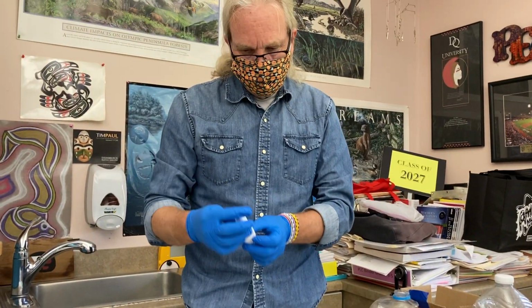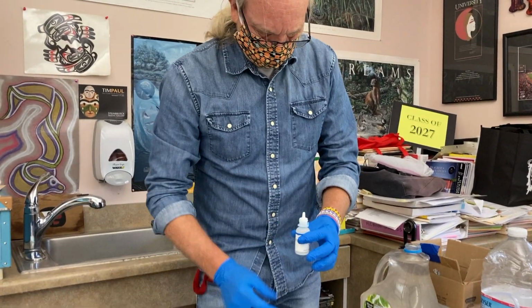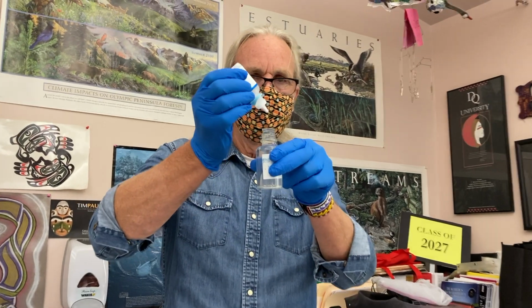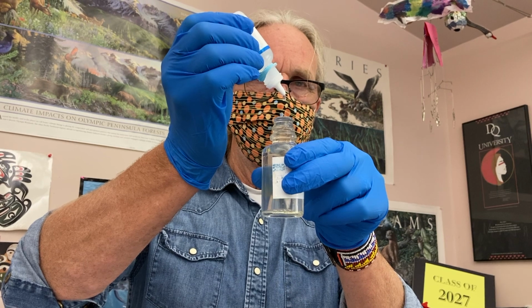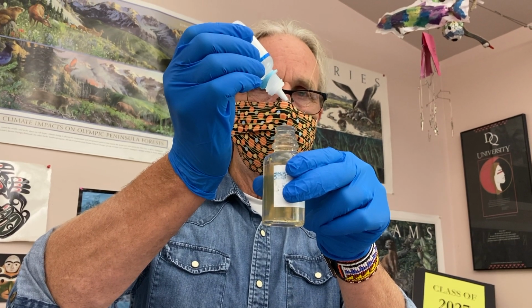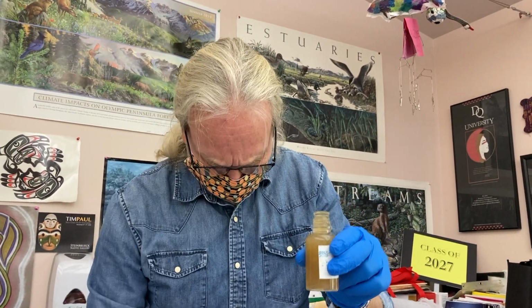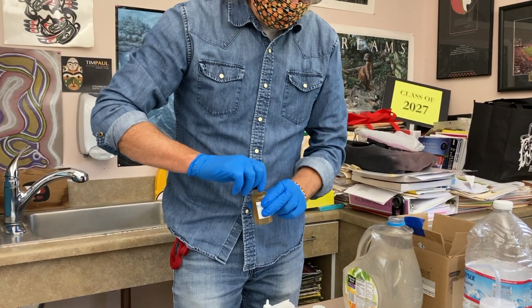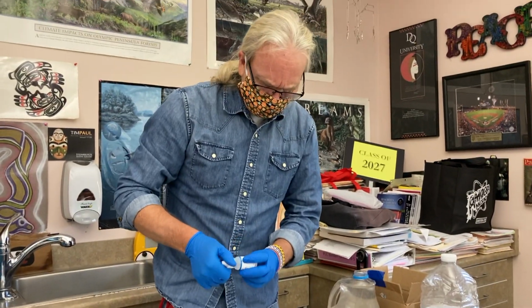Now we're going to add alkaline potassium iodide, another chemical, and watch the chemical reaction as it happens. 1, 2, 3, 4, 5, 6, 8. Okay, something's happening. It's all brown. There's a little overflow, obviously, because we filled it to the top, and then we started adding drops.